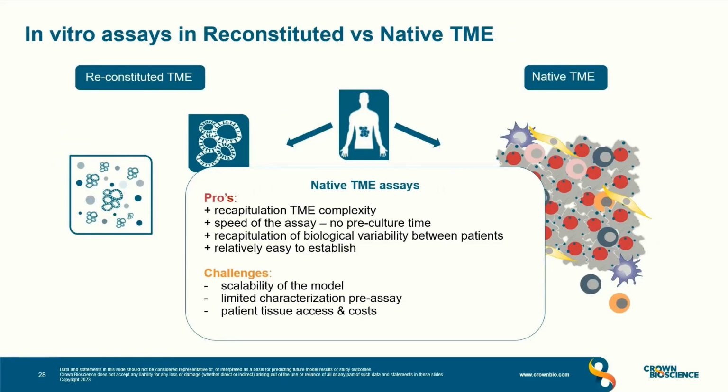With this, I hope I provided you enough insight about the various possibilities of the ex vivo assays with native tumor microenvironment. I would like to conclude by listing the main advantages of these assays, such as close recapitulation of the human TME complexity, the speed of the assay, we don't need any pre-culture time and can work straight from the patient, the recapitulation of biological variability between patients. Think of the in vitro clinical trials. Relatively easy to establish these assays.